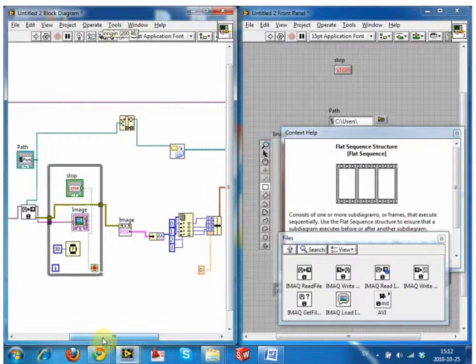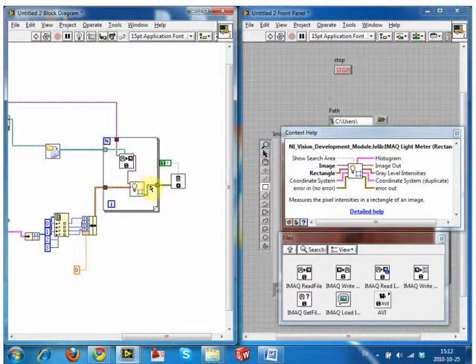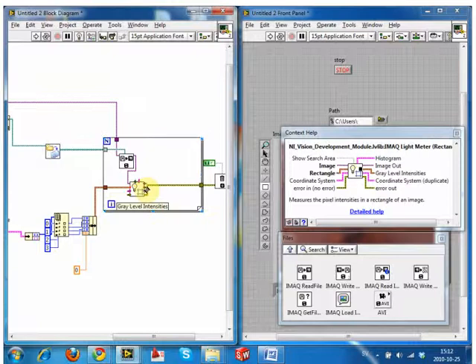The last thing that we need to do is get an output. So, what we want to do is figure out some kind of information out of here. These are your outputs. You can have histograms for this region, lots of other things, but most of the information is in this gray level intensities. And just like the input, we have the same kind of color, same thickness wire. So what that means is it's a cluster again, and we need to break out that cluster.